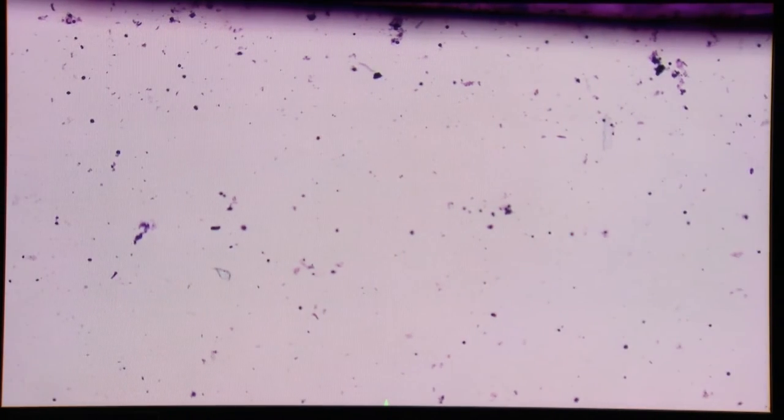There's the edge of the coverslip and you want to slowly go along looking for cells, clumps, casts, and any large crystals or debris. You do this on both stained and unstained sediment on 10 power, which is low power.